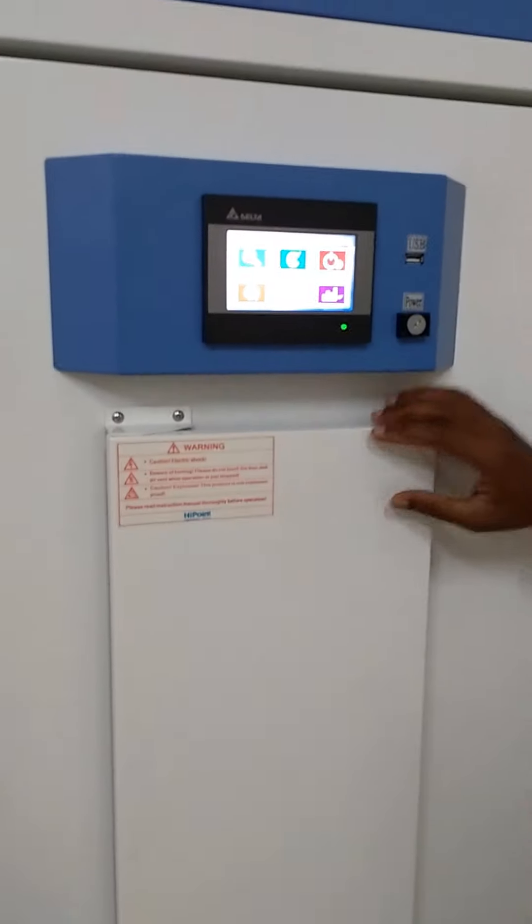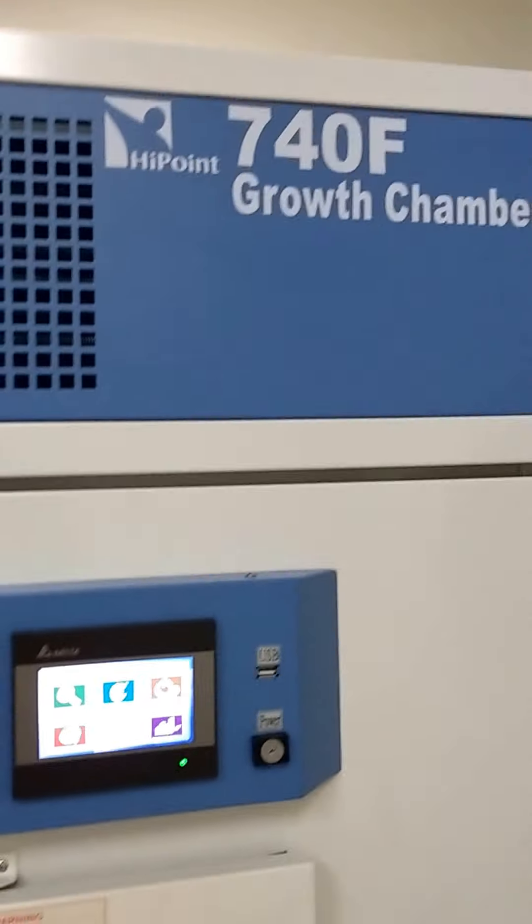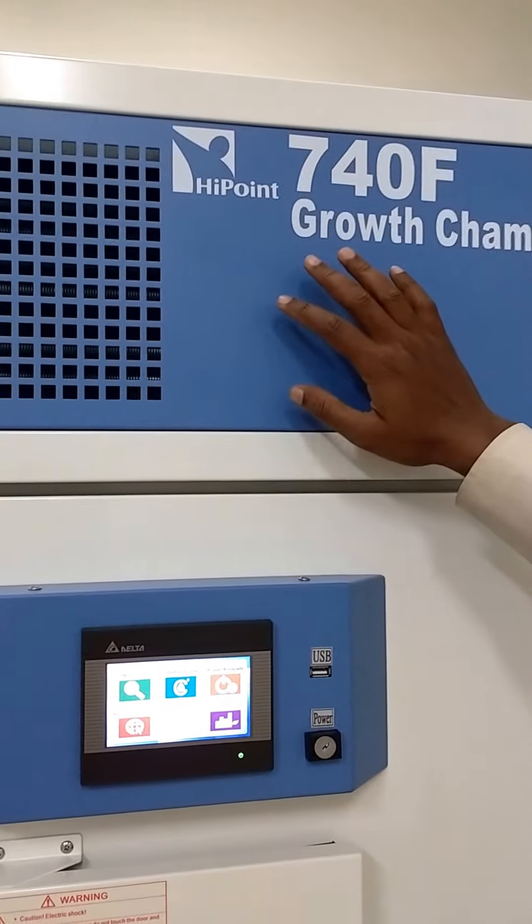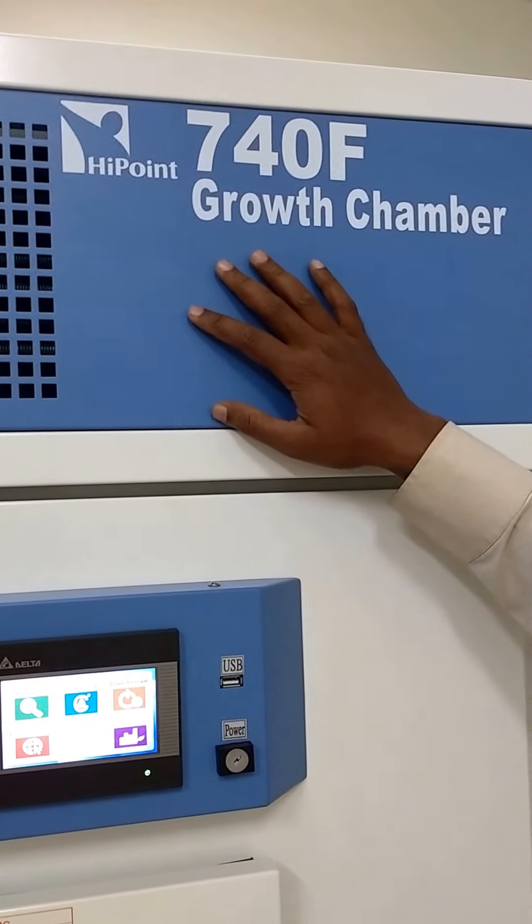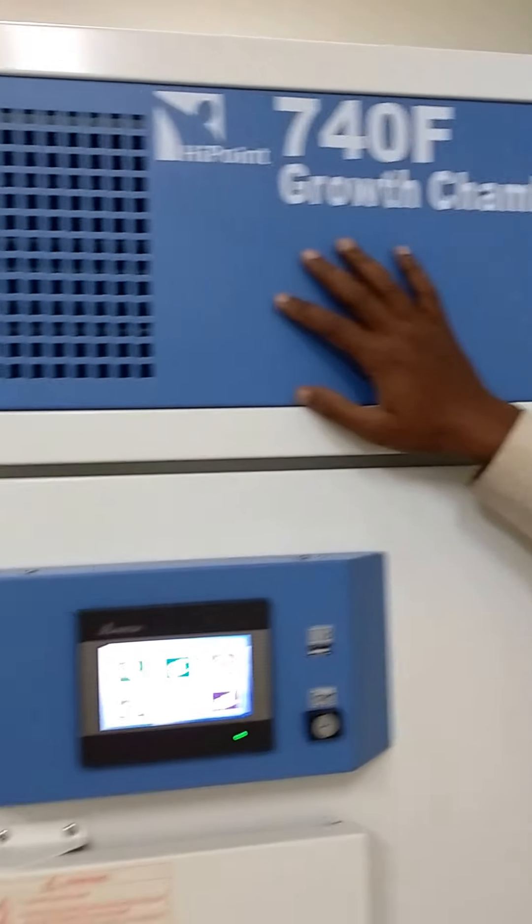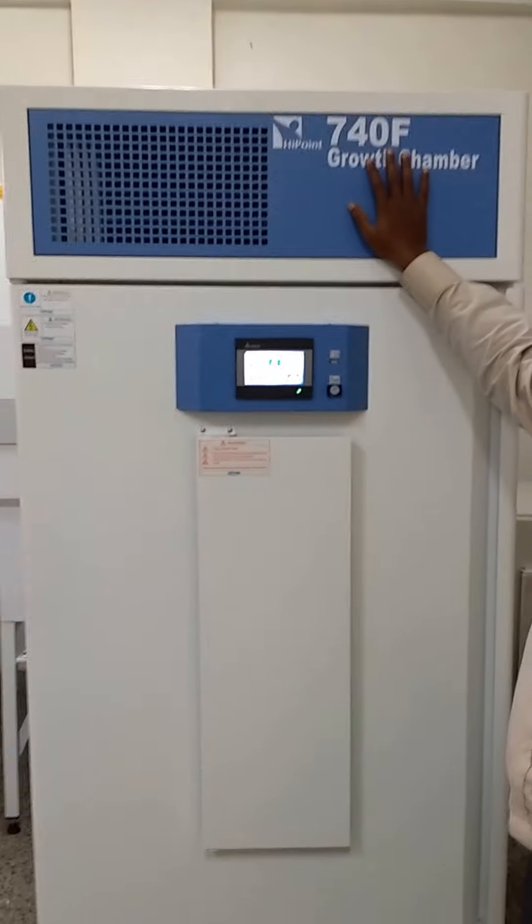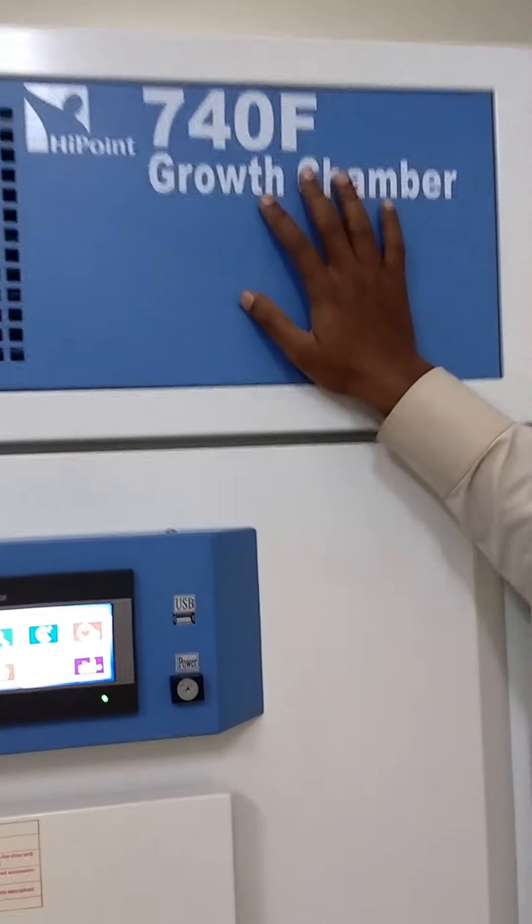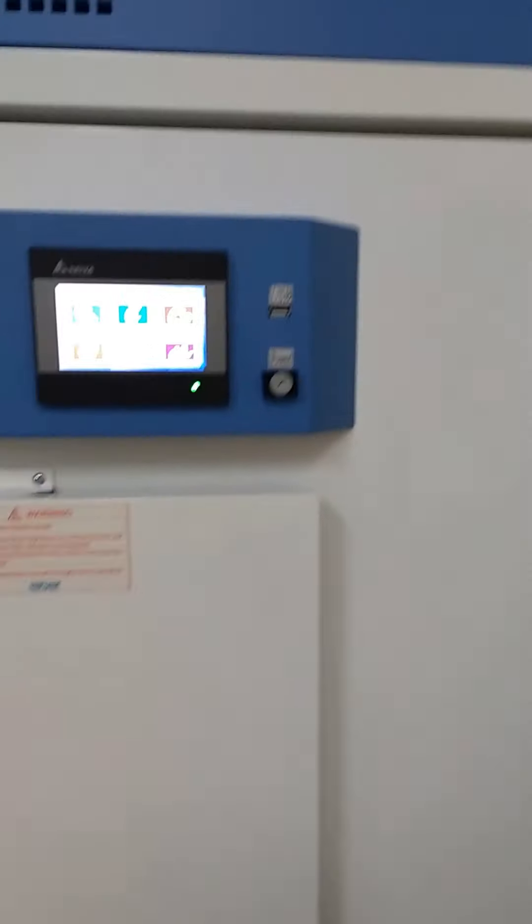Coming to external parts, the compressor is on the upper side of the BOD incubator or growth chamber for easy dissipation of heat, and it has a heater at the downside.